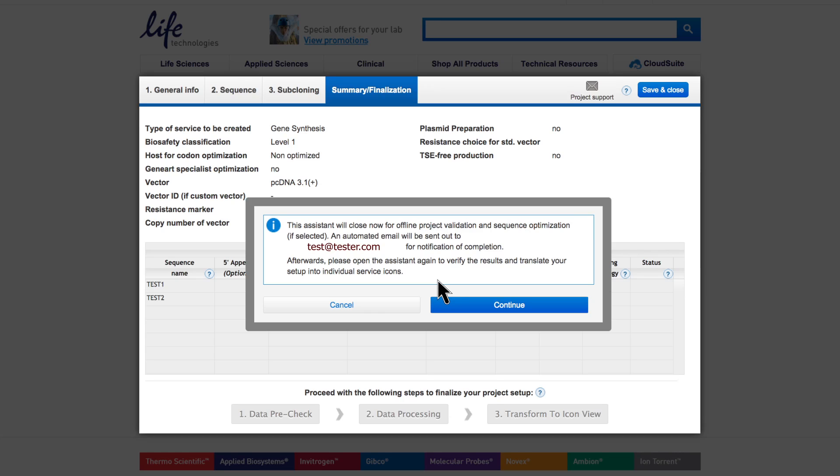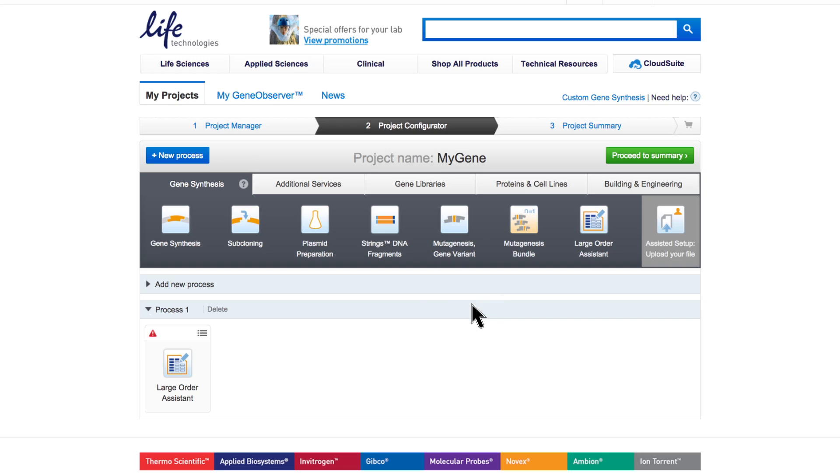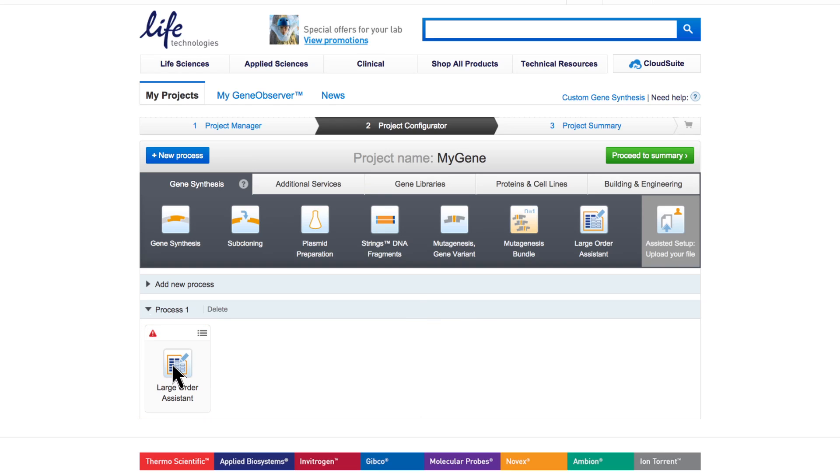Processing time depends on the project size, the sequence lengths, and whether optimization is required. During data processing, you cannot open the icon. This is indicated by a red flag. As soon as you receive your confirmation email, click to open and continue.